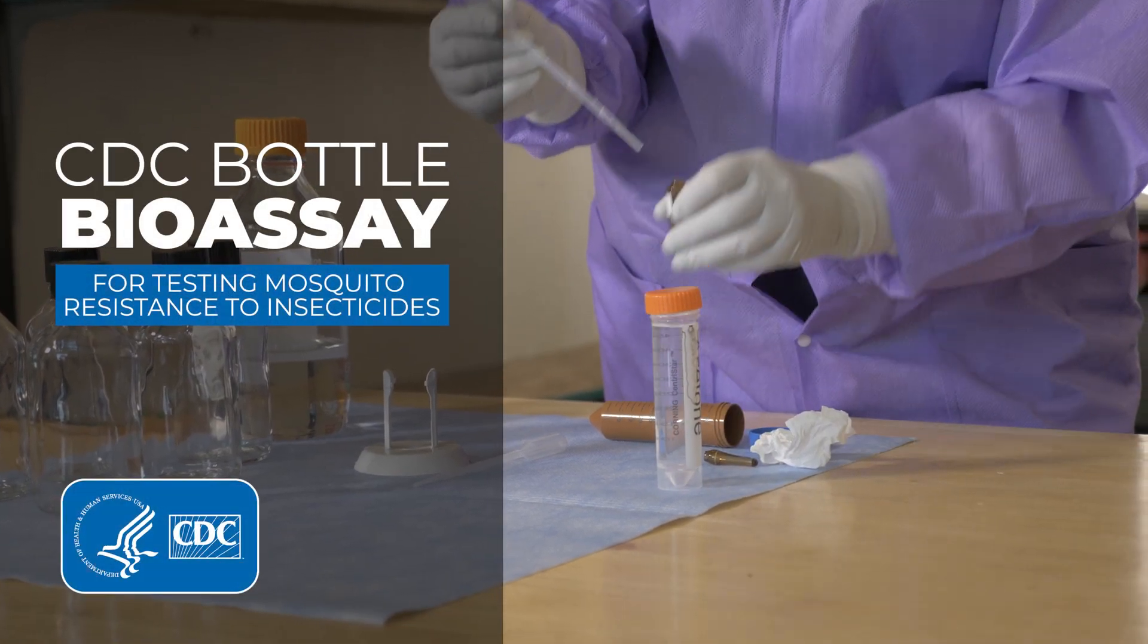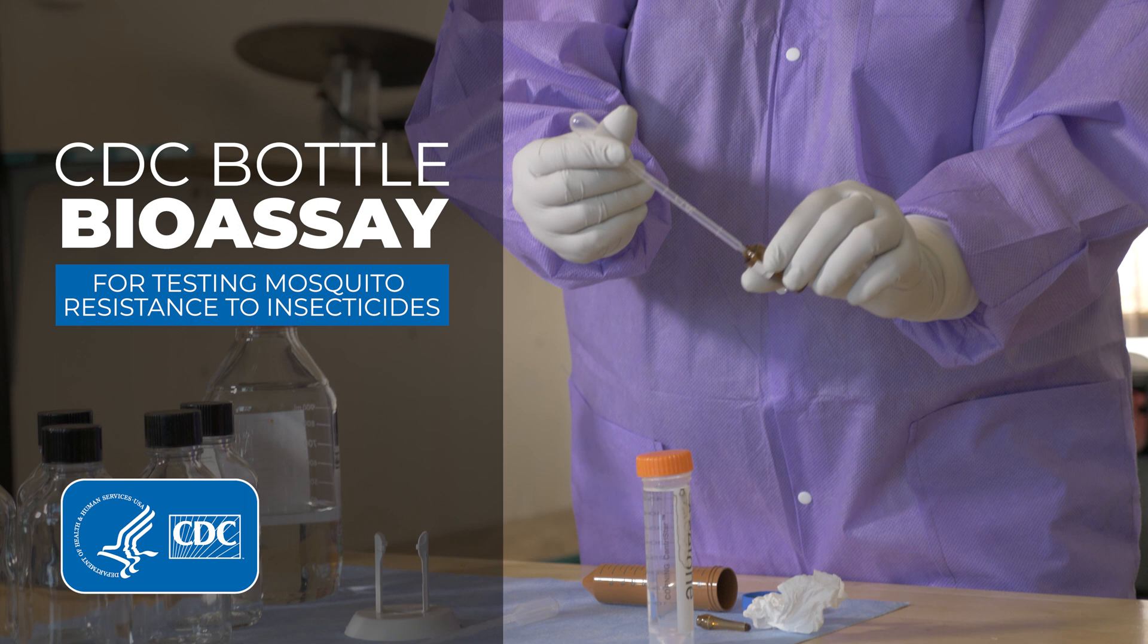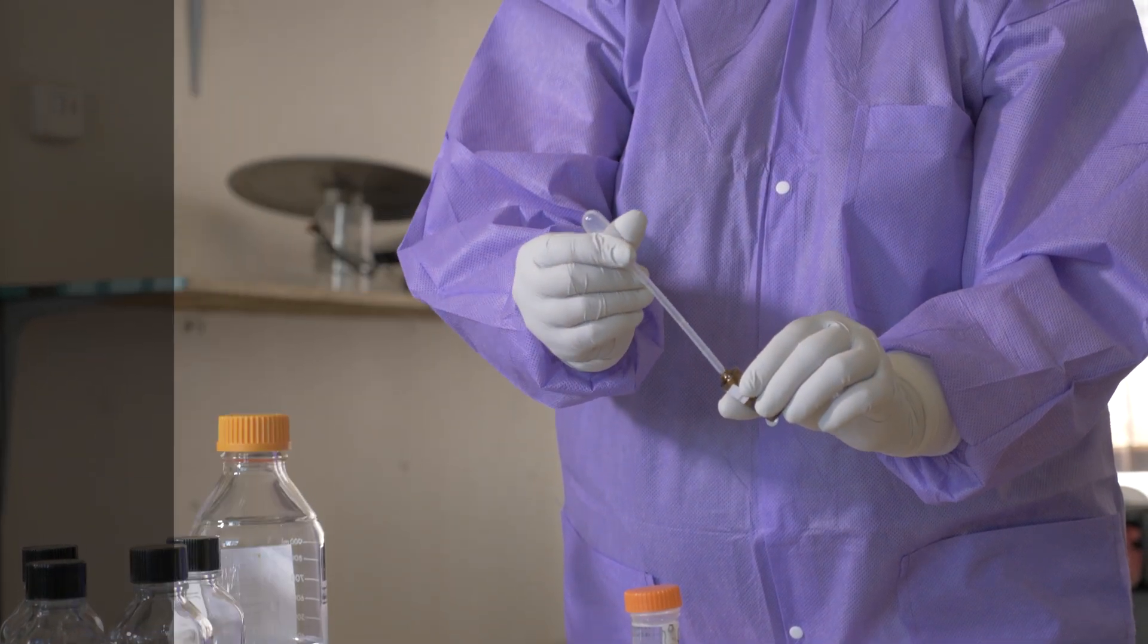In this video, we'll discuss insecticide resistance and how to use CDC's Bottle Bioassay to test mosquitoes for resistance.